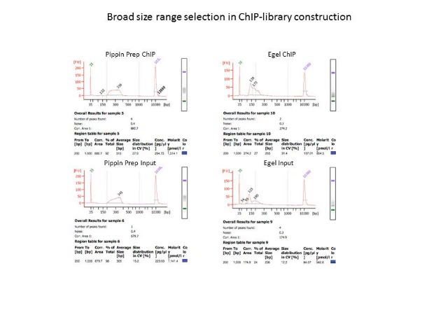So I did not end up sequencing this particular sample. I did do bioanalyzer on it and some qPCR testing. So on the left-hand side, you can again see the Pippin prep, and on the right-hand side column, you see what happened in the eGel. So on the Pippin prep, everything looks as normal, and the bioanalyzer looks very, very clean and nice. I'm using the high-sensitivity dilution of the sample and the high-sensitivity chip.